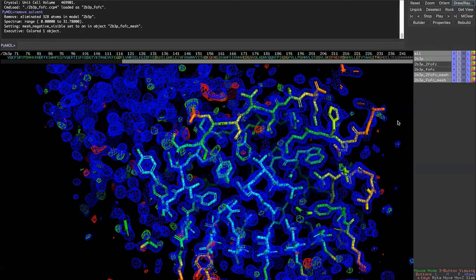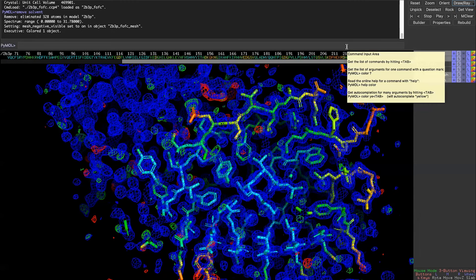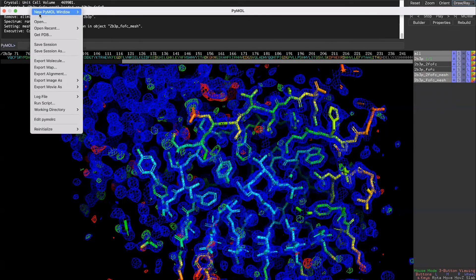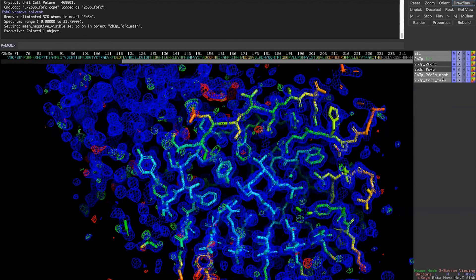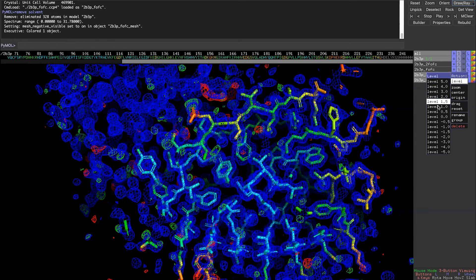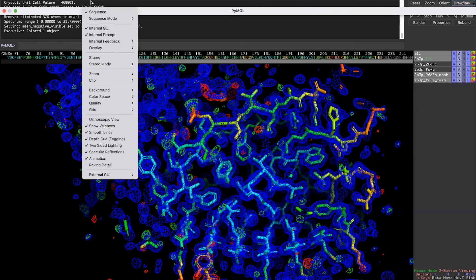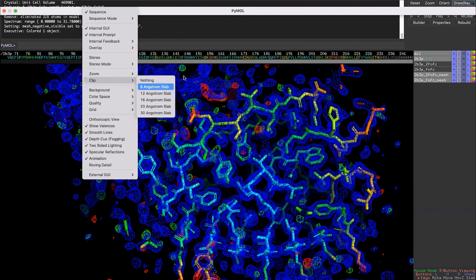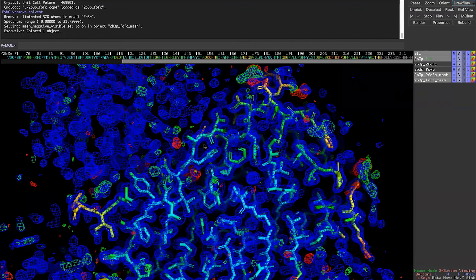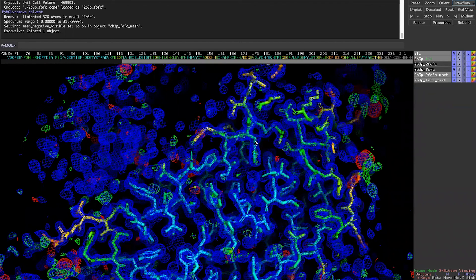So hopefully that helped you understand how to view and interpret these maps. To recap: you can use 'fetch' with 'type=2fofc' or 'type=fo-fc' to get those maps, or go to File > Get PDB. Once downloaded, go to Action > Mesh to show the map, then change the level, do zooms and clips to navigate through everything. There's also a bunch of things you can do with your keyboard and mouse. Happy exploring!